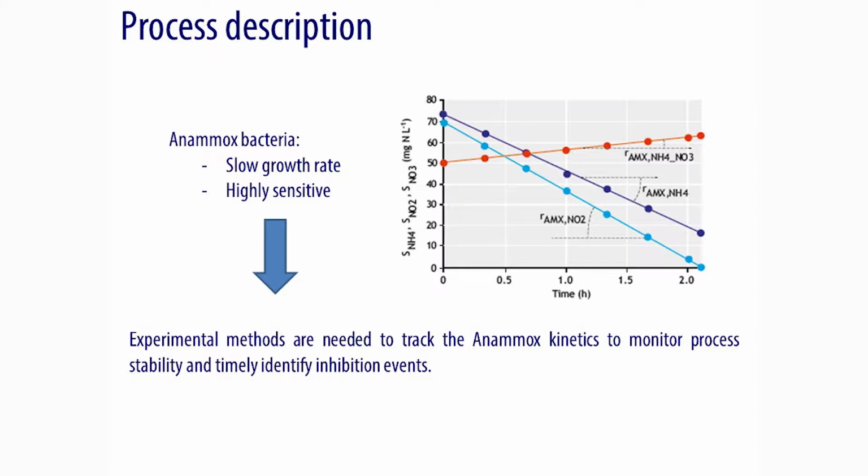From a monitoring perspective, there is a need to track the kinetics of the process in lab and full-scale systems, not only to assess the process stability and follow the enrichment of the biomass, but also to avoid potential inhibition events.